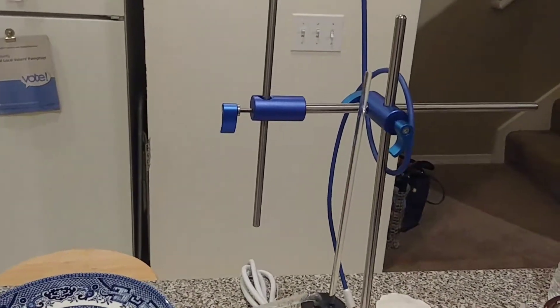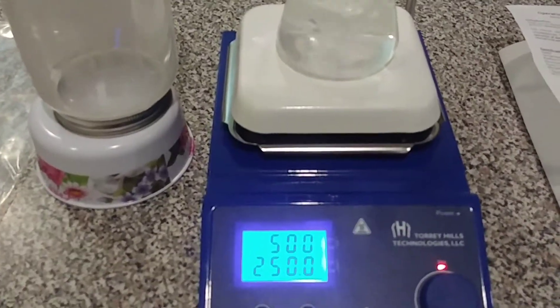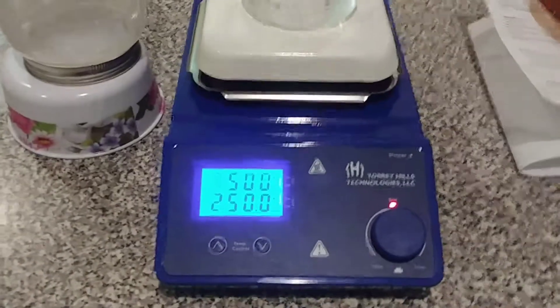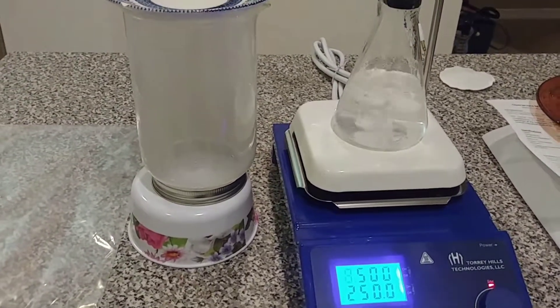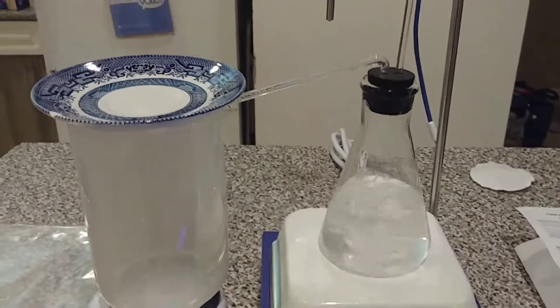I paid a little extra to get a real-time temperature sensor. I need to get a different stopper so I can actually insert it, but I'll be able to set my hot plate to, say, 102 degrees, and the real-time sensor will measure approximately 100 degrees for the boiling point of water. I'll probably go to the hardware store and get some stoppers and drill holes for the glass tubing and the temperature sensor.